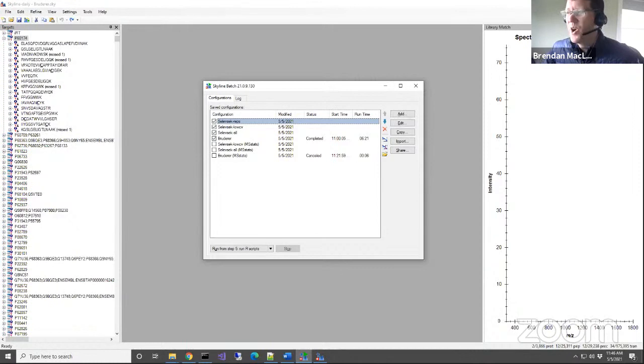If you're saying, oh, I want a human DB or even bigger DB, and you're going to do hundreds of samples and you want to query 100,000 things, so that's going to be millions of transitions, I think probably that's not a good fit right now. That's going to end up being too big.